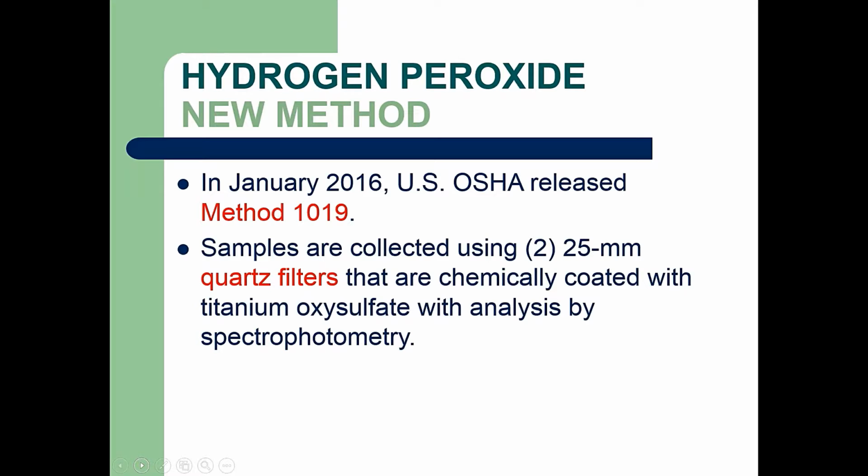The filters are chemically coated with titanium oxysulfate and are analyzed by spectrophotometry. These filters are available from SKC preloaded and pre-coated using the catalog number shown here, 2259030.